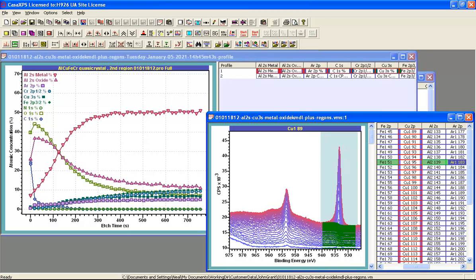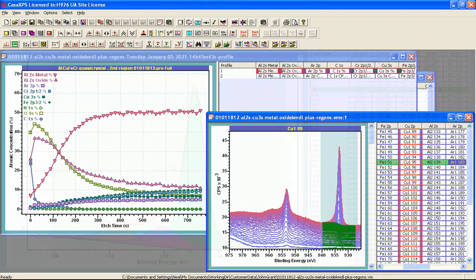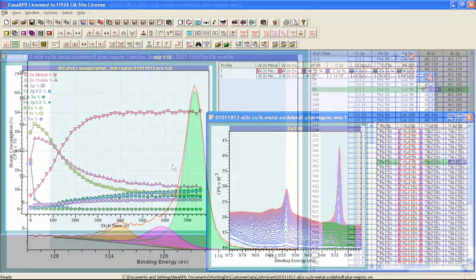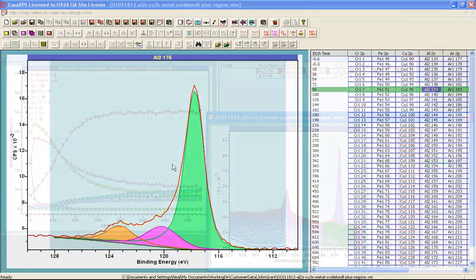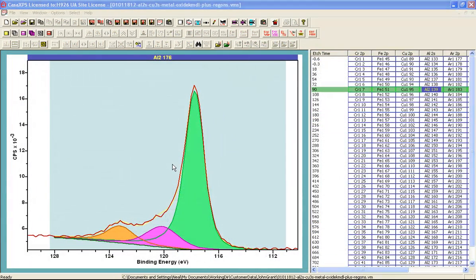So what I will do now is create a depth profile from these data and then we can see the differences in how we would like to display the data.